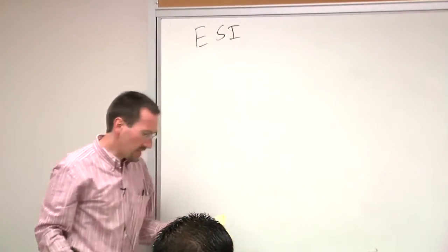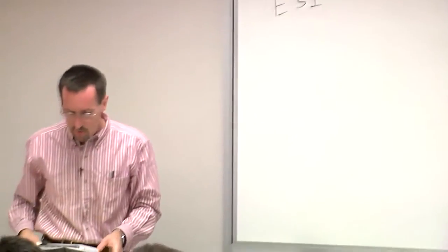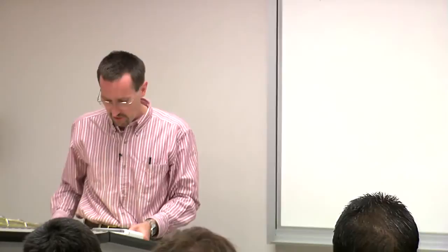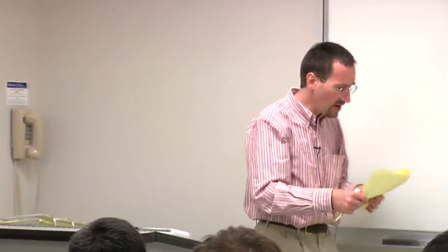ESI is another technique that's widely used now. These are our open access instruments. Mass spec has become very populist, very cheap, very easy to do. One of the reasons is that a regular EI mass spectrometer is a relatively fussy instrument, although they're often made into parts of gas chromatographs and so forth, but they often require a lot of care.